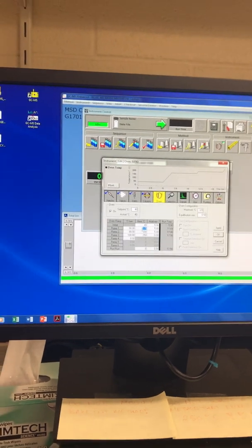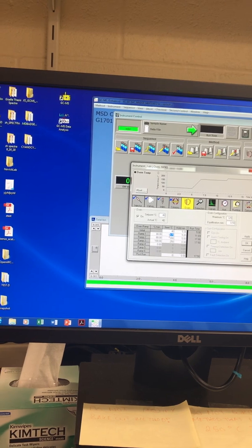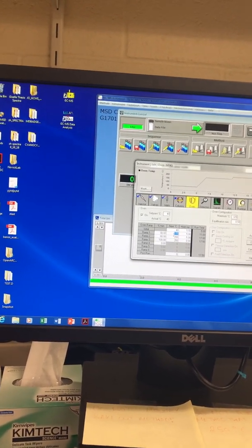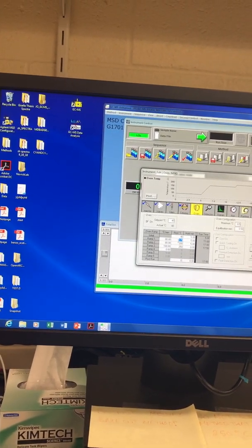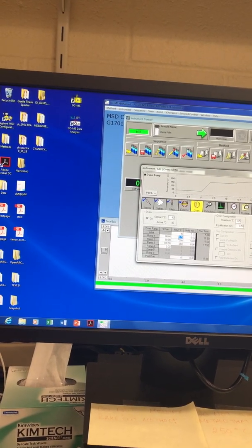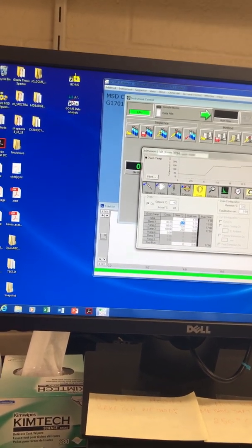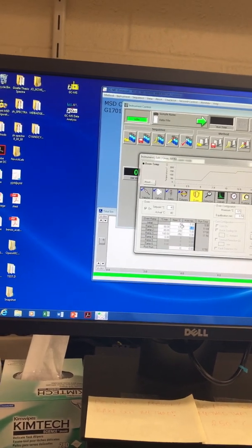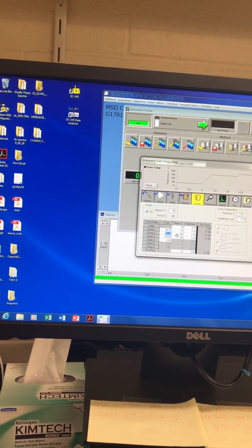The next analyte to come off would actually be the 4-dimethylaminopyridine. So I expected that to come off at about 162 degrees Celsius. So I set our method, I set this one to come off at about 175 degrees Celsius. And it should sit there for 5 minutes, so all of this analyte comes off the column. Then I increase the ramp rate to about 80 degrees Celsius per minute.